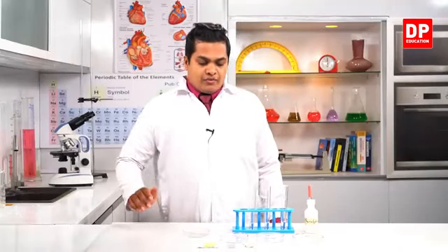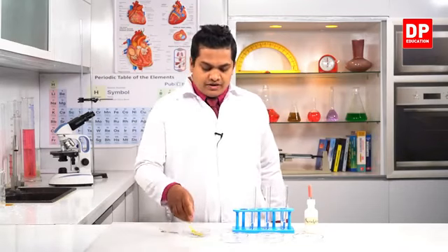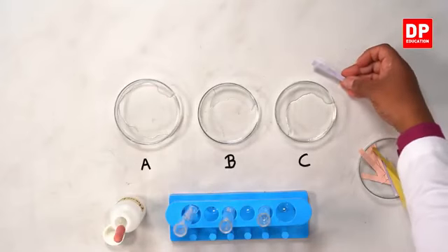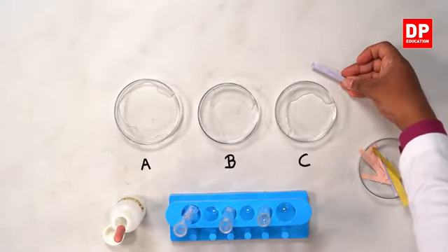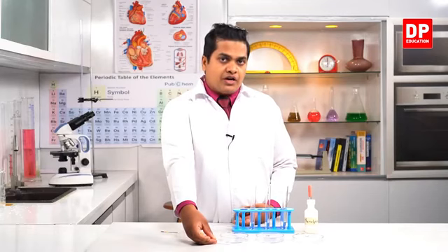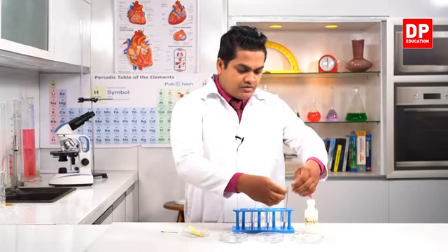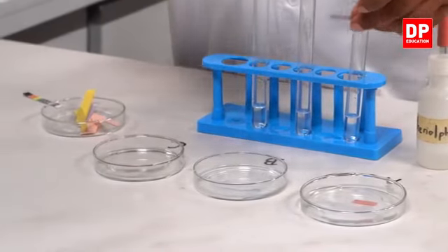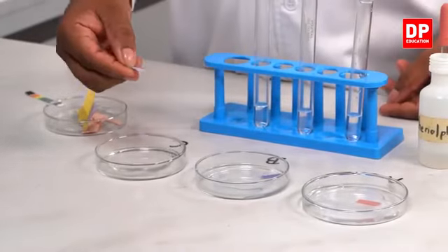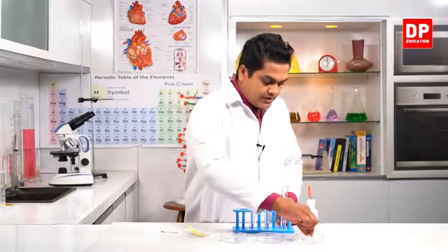Right, my dear children. So I'll remove these papers to a side and keep them in the Petri dish that I have in here. So first of all, I am going to take blue litmus. So we'll add blue litmus to each of these Petri dishes and we'll observe what will happen to the color of the blue litmus paper. So we'll add a piece of blue litmus to A, a piece of blue litmus to B, and finally to C.